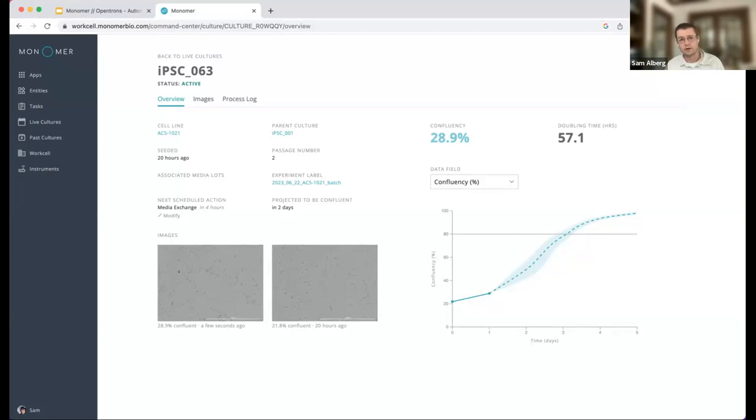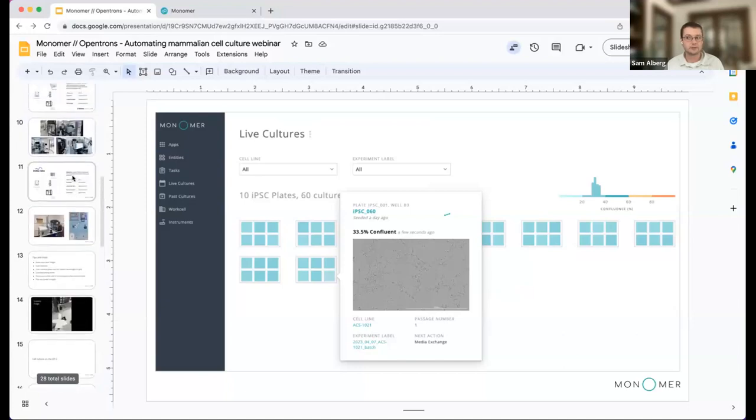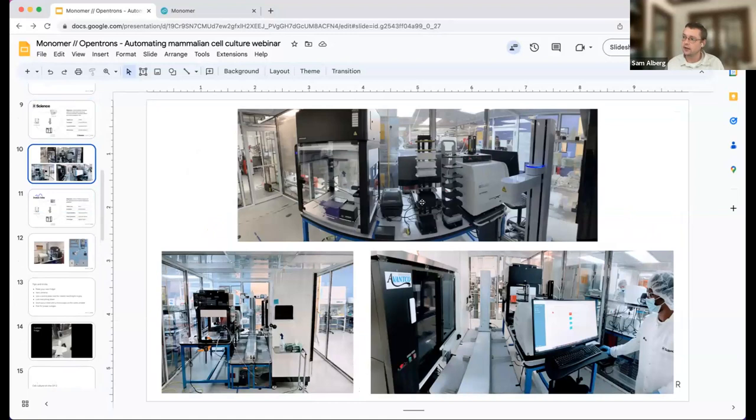What is a ballpark cost with a robotic arm and other instruments? This is all based on what your hardware setup is. The robotic arm is going to go for about $30,000. Microscopes go for about $40,000. And then the incubators are quite variable. If you can get things used, you can reduce the cost. For this particular work cell at Science, you're looking at about $150,000 to $200,000 of hardware. But generally speaking, this is the cheaper way to automate cell culture. A lot of these all-in-one instruments that do, for instance, flask-based culture are going to be hundreds of thousands to seven figures in cost.